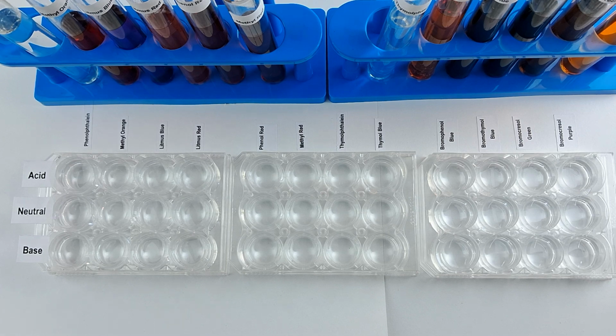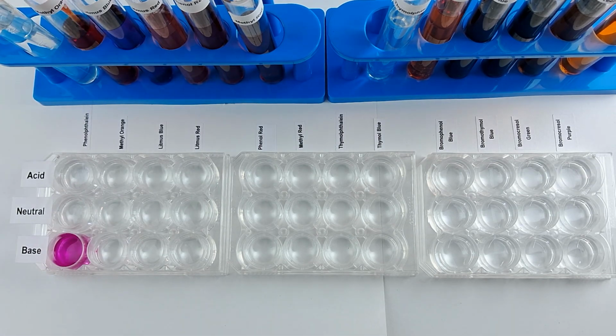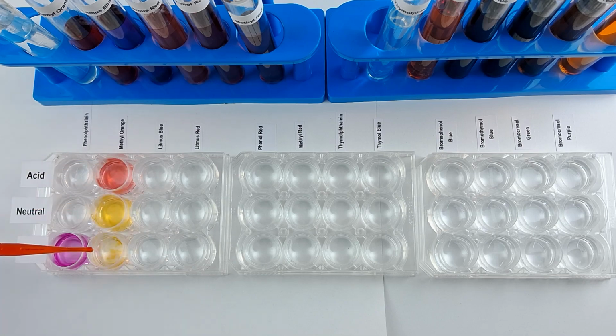Next, using separate clean droppers for each indicator solution, we add a few to several drops of the indicators to the wells marked acid, neutral, and base, following the labeling pattern of the indicators.